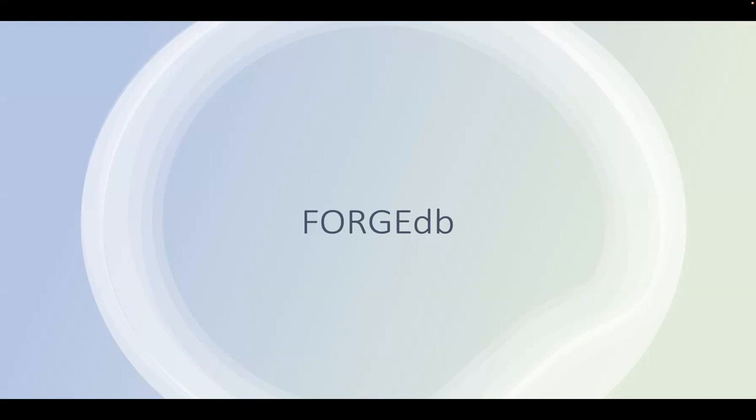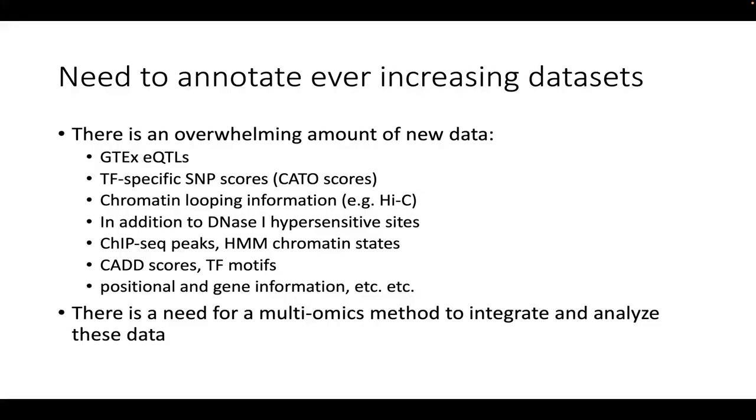But let's talk about the key method that we want to talk about, which is a derivative of FORGE2, which focuses on analyzing particular variants. And I'm sure this is what will be most useful here. So FORGEdb is the next iteration to try to annotate all of these data sets. And as you know, there's a lot of epigenetic data and other genetic data out there. So eQTLs, transcription factor specific binding data sets like CATO, and you have chromatin looping information. You have DNase hypersensitive sites, you have ChIP-seq data, chromatin states, CADD scores, and motifs. You have all kinds of data.